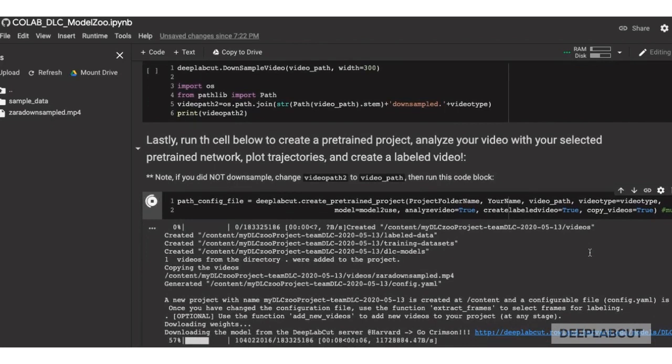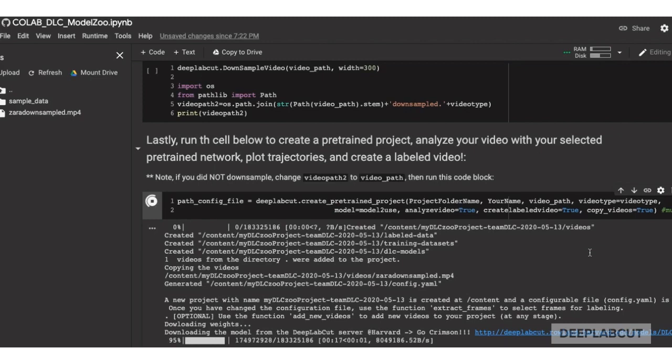In addition to the weights being downloaded, we're now creating a full Deep Lab Cut project, which you can download for future use. But right now you can look in the file browser to the left, click refresh, and you'll see this project created.